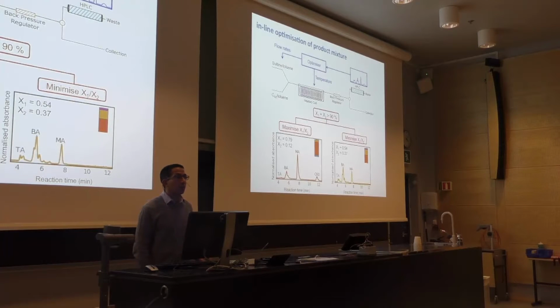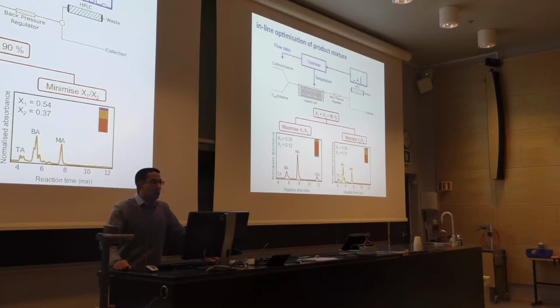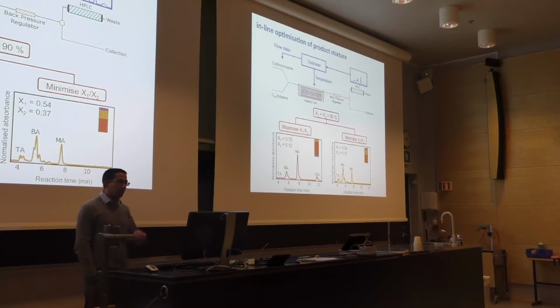You're using a syringe pump, right? We use syringe pumps, yeah. Have you seen any effective oscillations? Because we have that problem in our system. Yeah, we spend lots and lots of time balancing things to get nice stable flow. If you don't balance things well, you don't use the right back pressure regulators, then you can experience problems. We kind of play around until we've got nice stable flow.